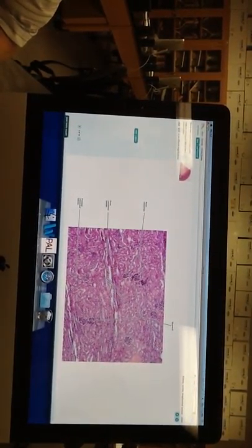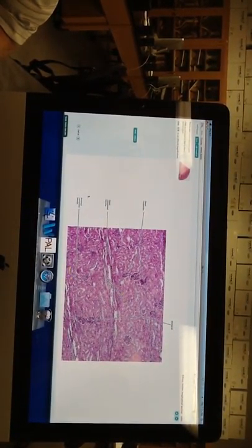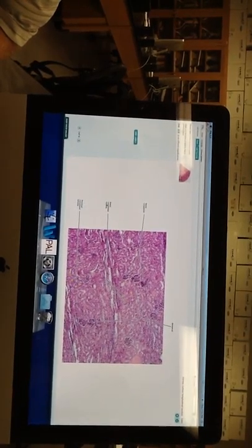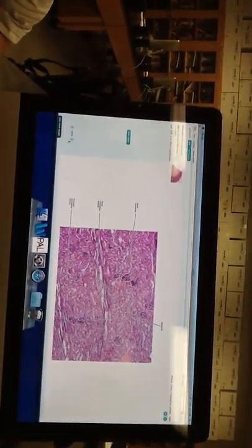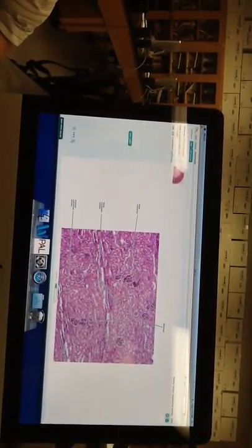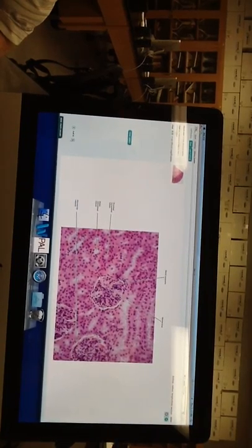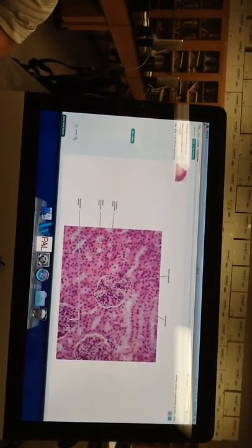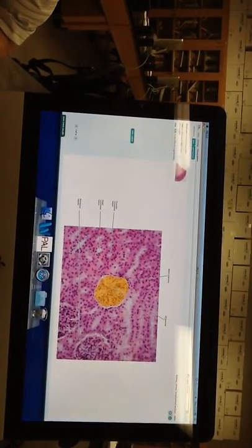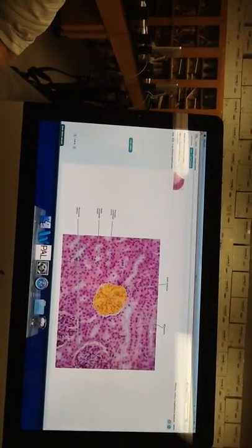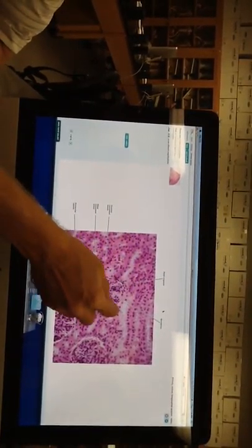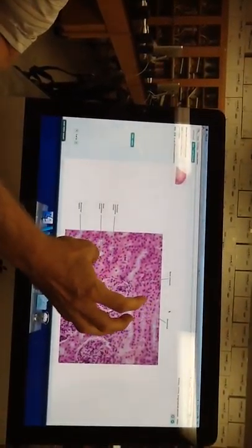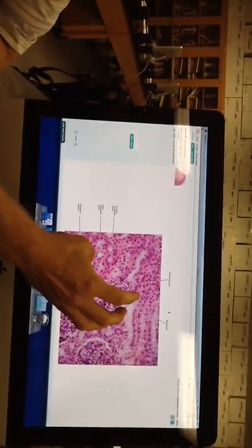It's really a beautiful thing with these amazing podocyte cells around them. But at this level, they just look like these balled-up capillary regions compared to all the rest, which basically looks like tubing. It's like one giant glandular organ. So I don't expect you to tell the difference between the different kinds of tubes, but that's basically it.